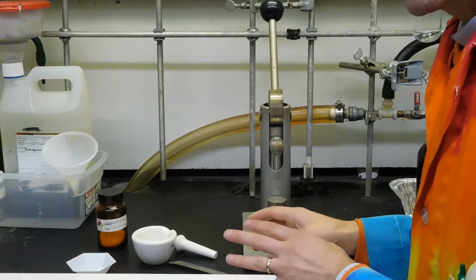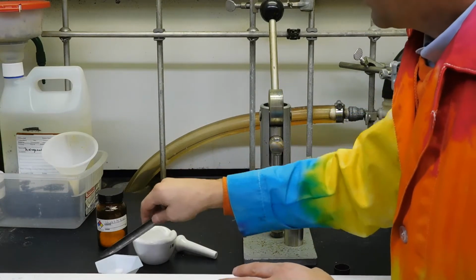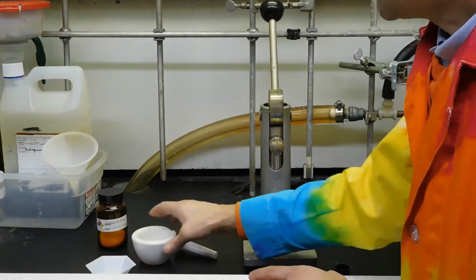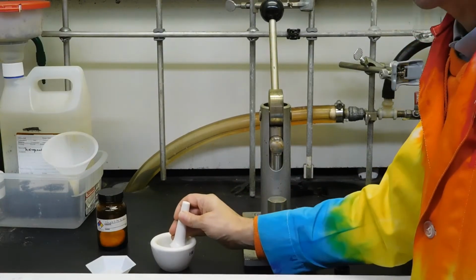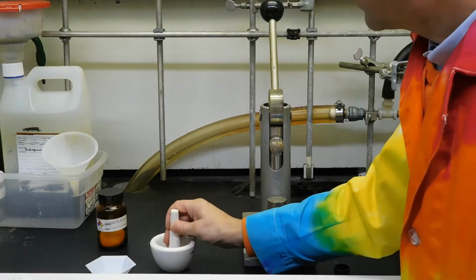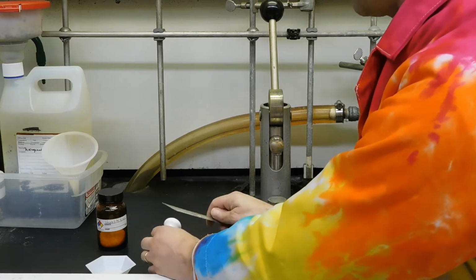So, I took some naphthalene previously, it's over here, and weighed it in this weigh boat. And then I'm just going to take it and pour it into a mortar and pestle, because to make a pellet, you got to grind it up. It was sort of chunky. You need pieces that are about a 1/2 millimeter on the largest dimension. That's ideal for making a pellet. So you just crush it gently. You don't need to make a fine powder. As a matter of fact, you don't want to make a fine powder.